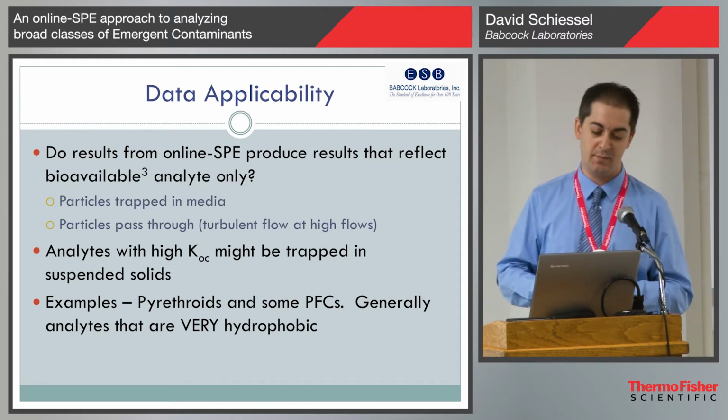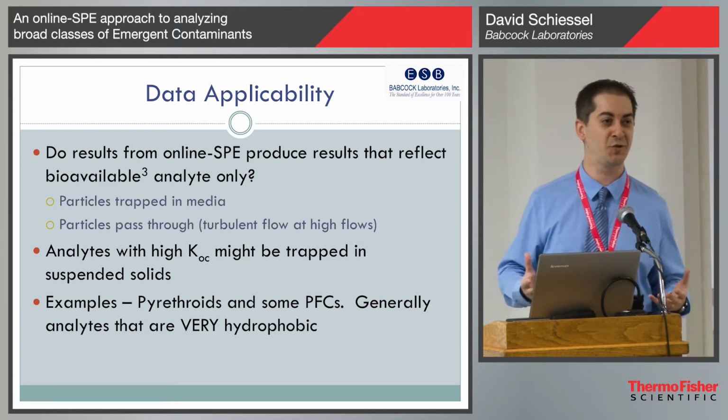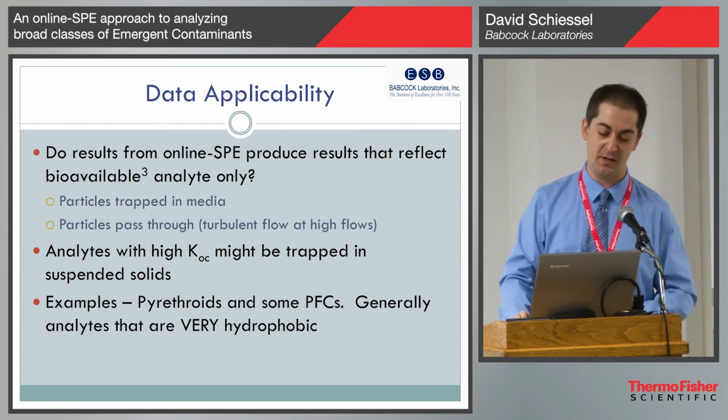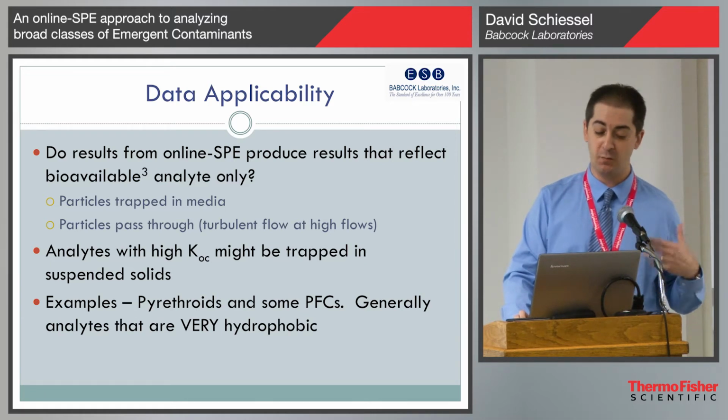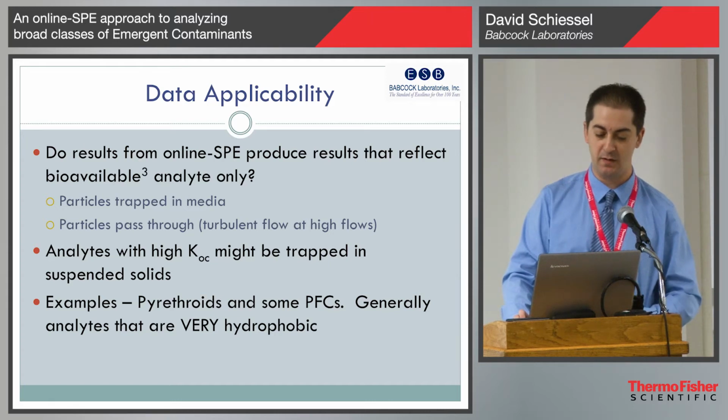This is something we haven't really looked at because we're a commercial lab. We don't have all the time in the world to research this, but it would be of interest. So pretty much any analyte with high KOC might be trapped in suspended solids, so it's just a concern. And this could possibly include PFCs, especially the longer chain PFCs.